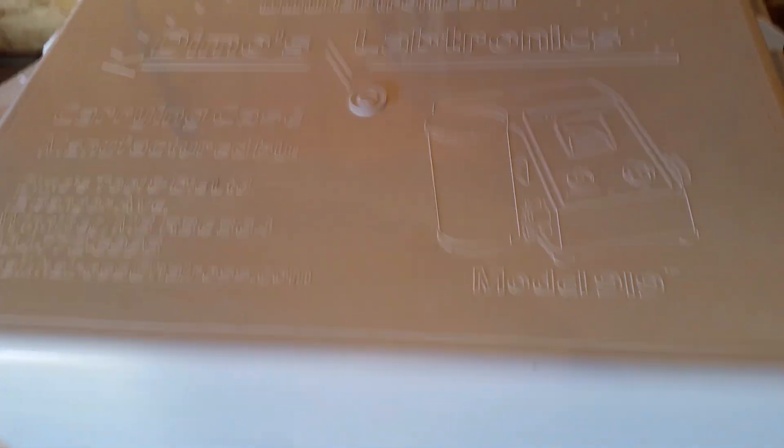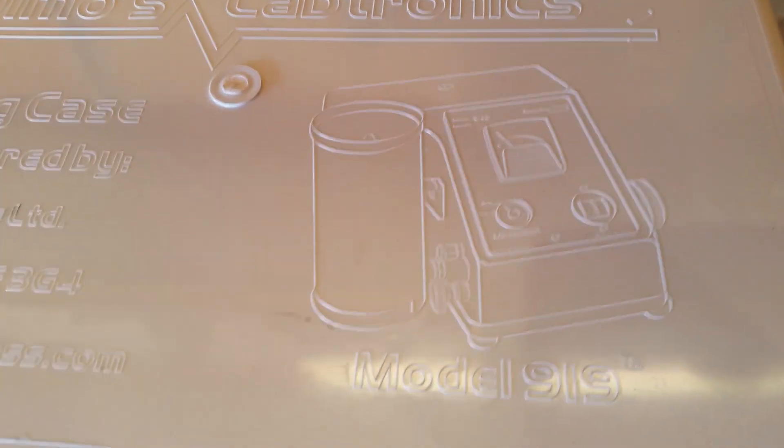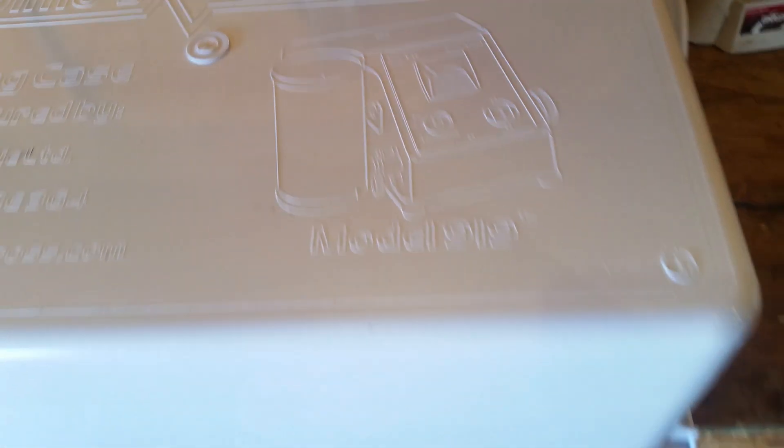I just thought I'd make a video on how we test the moisture for the grain. These testers test everything — grain, oil seed, anything. I just bought this one; it cost me $1,500. It comes with a nice case. It's a Labtronics model 919.